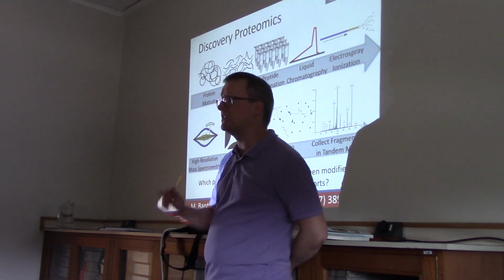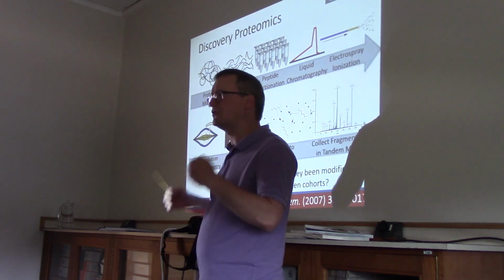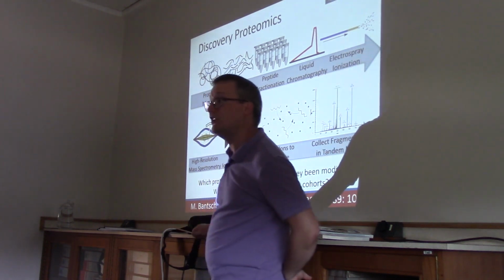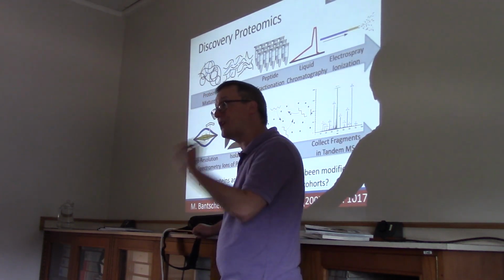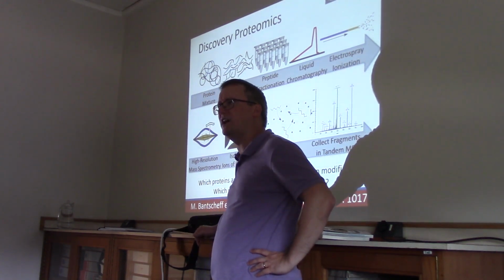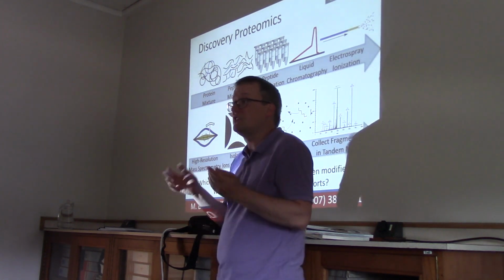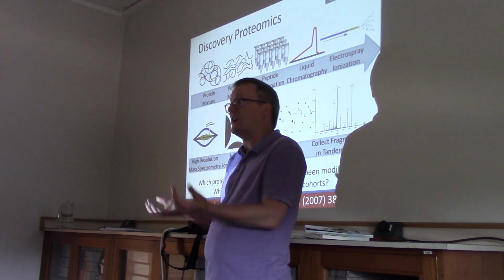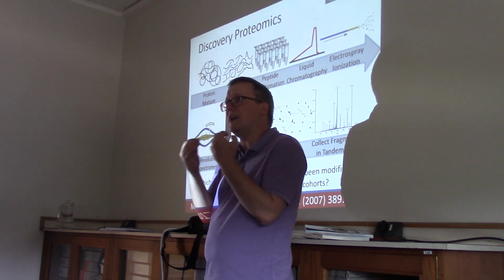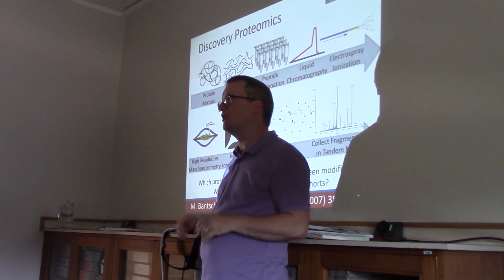But I mentioned that we're measuring them 2 ways. The first way is to look at them intact, to say what is the mass-to-charge ratio of the peptide ion. The second way is that we're going to look inside them. We're going to interrogate the structures of these peptide sequences. For that, we're going to isolate a whole bunch of ions that all fall at the same mass-to-charge value. So that the software is able to look at these mass spectra of peptides, intact peptide ions, and say what ions dominated, had the best intensity signals at this particular moment in time.